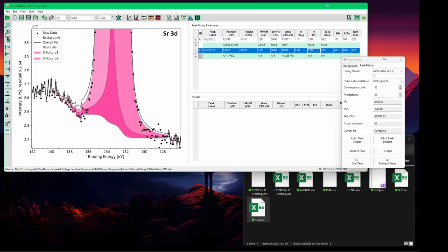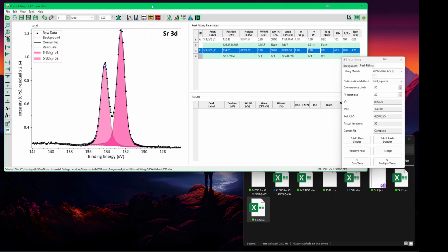And if I let it vary as well now, let it vary, and maybe even redo the whole lot. So I can drag the peak down. Let me just show you. I can drag the peak down and let it vary by itself by using the halt. So the halt you will be able to move the peak.